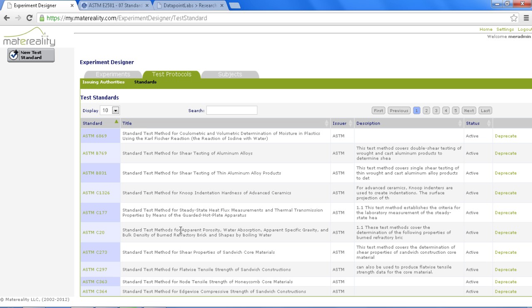So at this point in time, I have created a test protocol, which I have then proceeded to attach to an experiment. So now when I'm loading data for that experiment, I can call this test protocol and say this is how this particular experiment was performed.